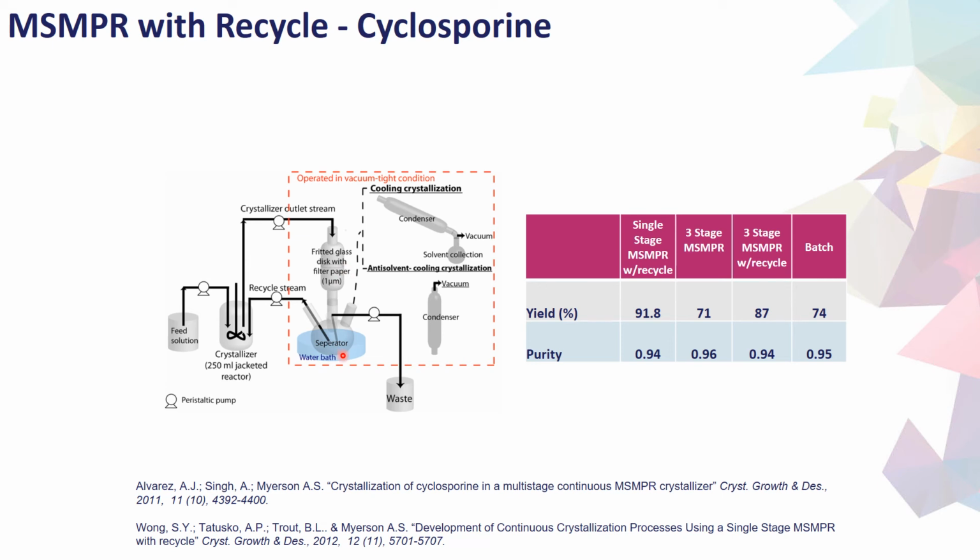So really, in continuous crystallization, we can run our crystallizer at a steady state that mightn't have the highest yield, but we can utilize recycle strategies in order to maximize yield and purity trade-offs. While this does give you a better yield and purity trade-off, it does reduce productivity if you use very high recycle rates back into the vessel. So this is something to consider. You have a trade-off between productivity, yield, and purity.